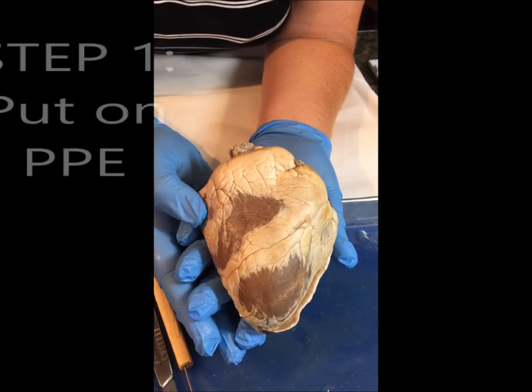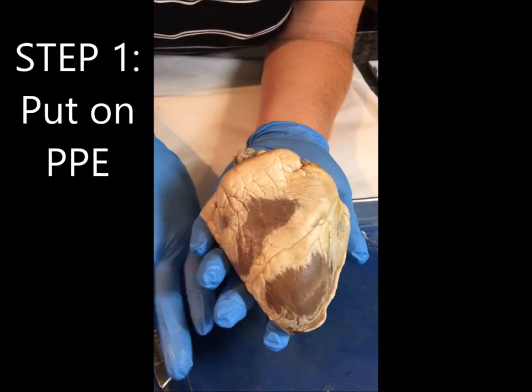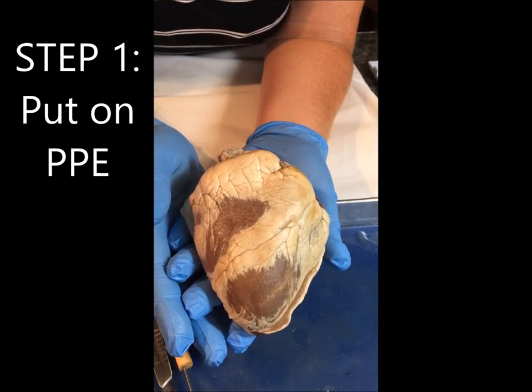Today I'm going to take you through the sheep heart dissection. You'll notice that I have my PPE on — my gloves, my apron, and my goggles.